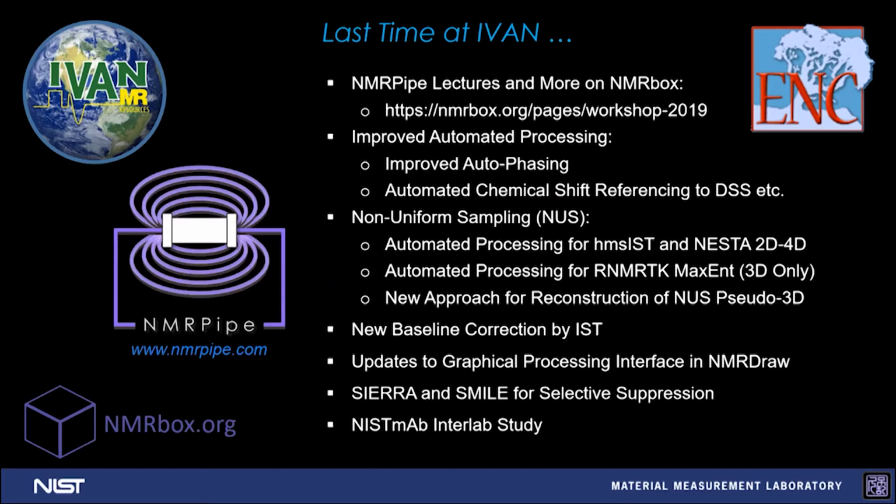Last time we gathered the Ivan group, we talked about lots of interesting things, including magnificent lectures available on the NMR Box website. And we're going to hear more about NMR Box from Mark Machevsky of UConn in a little bit. But in terms of what bits and pieces we've added to NMRPipe, these include improved auto processing for bulk collections of spectra, which also means improved auto phasing, automated ways to chemical shift reference spectral data, and lots of improvements to non-uniform sampling spectral handling.